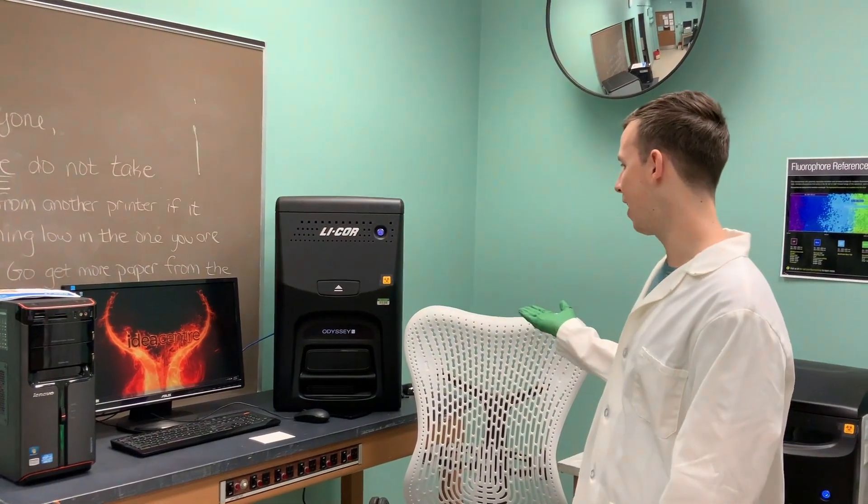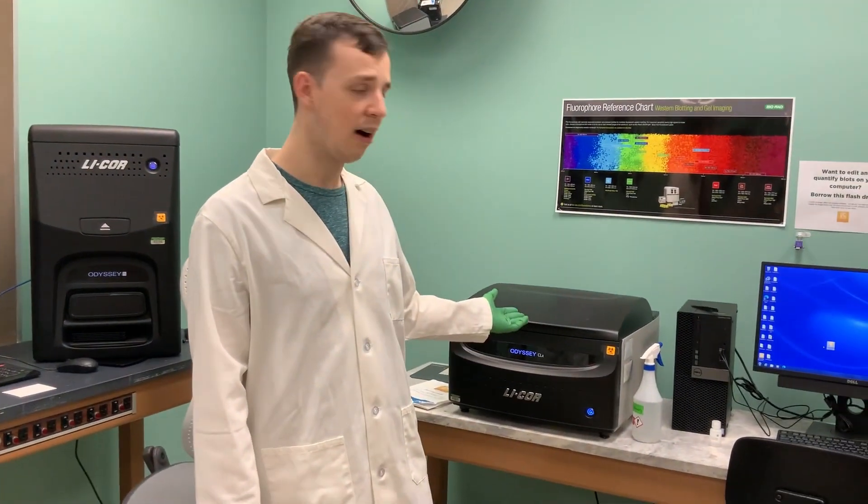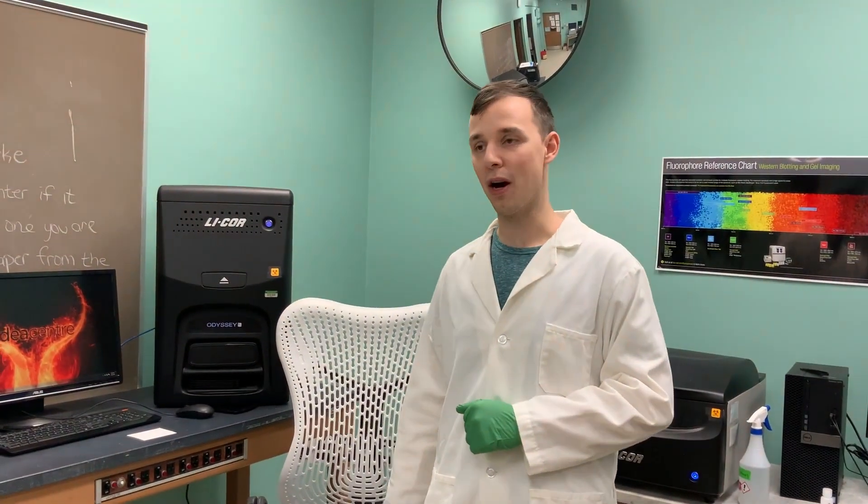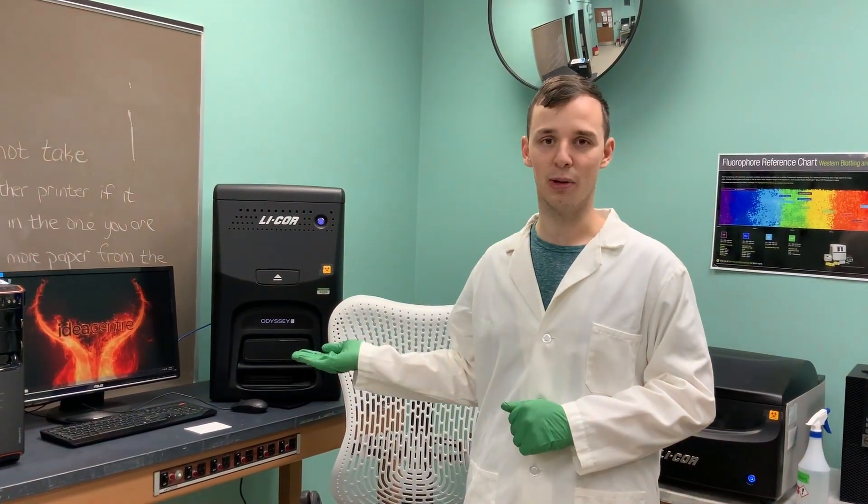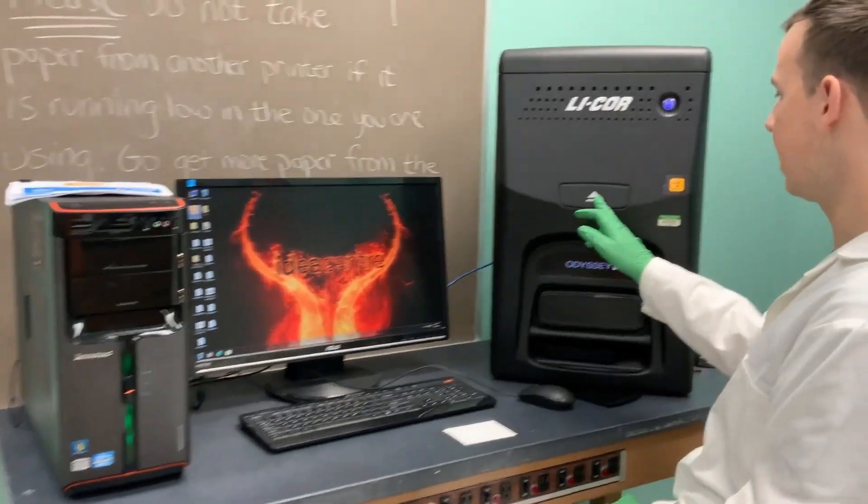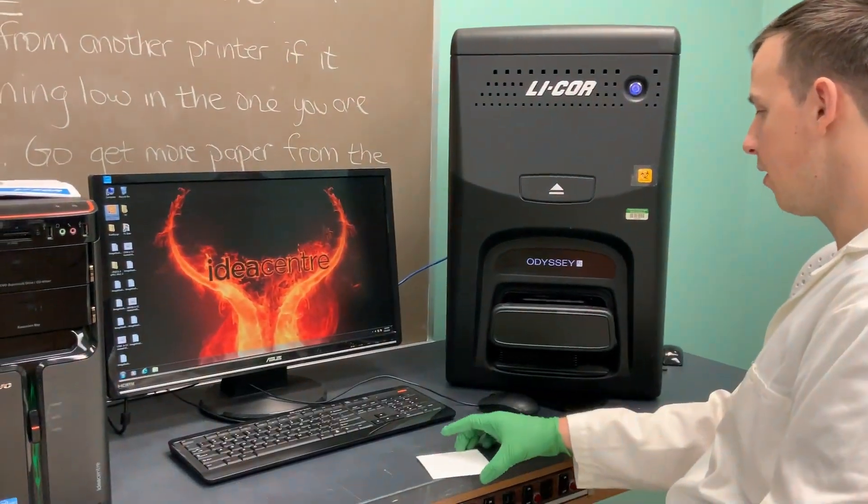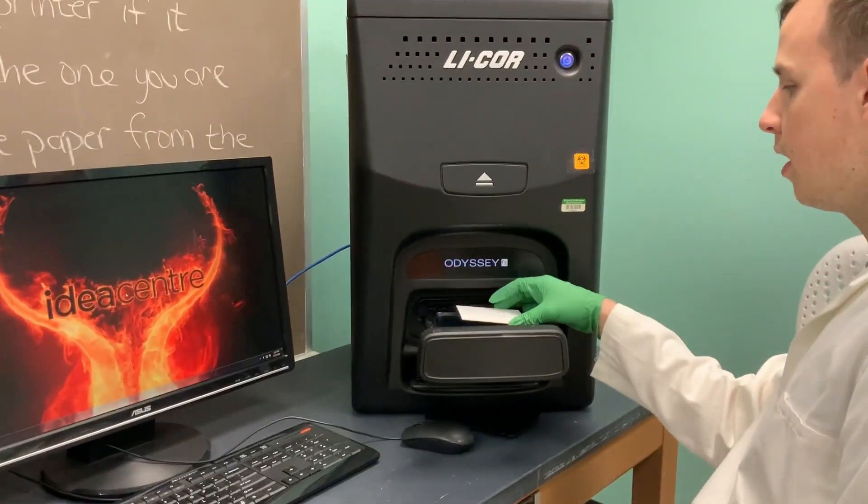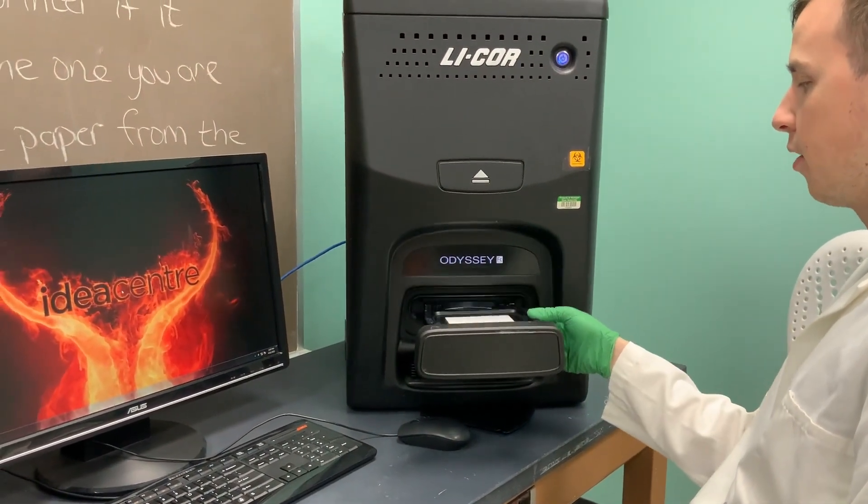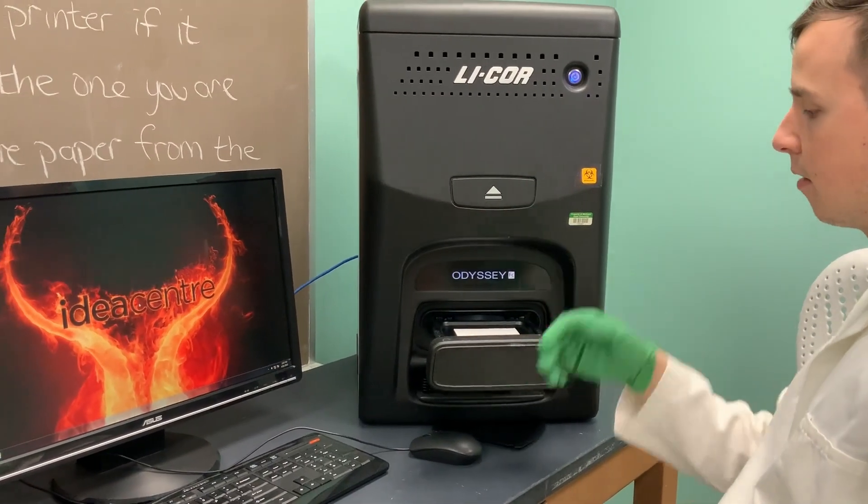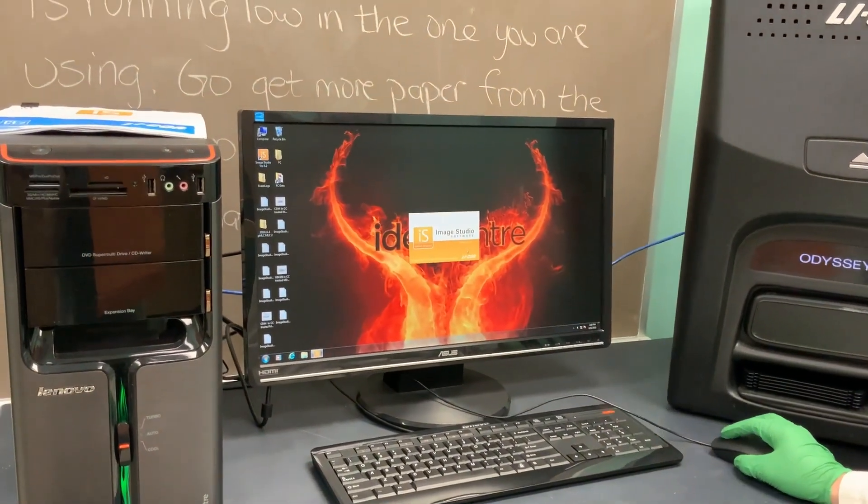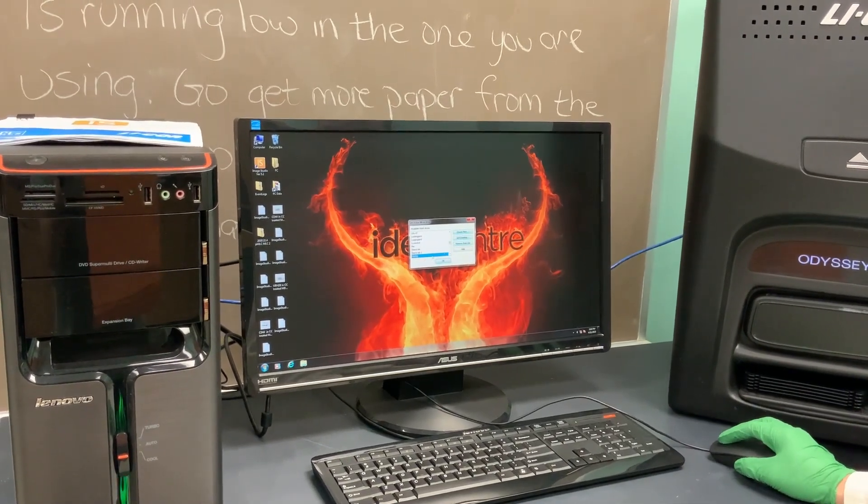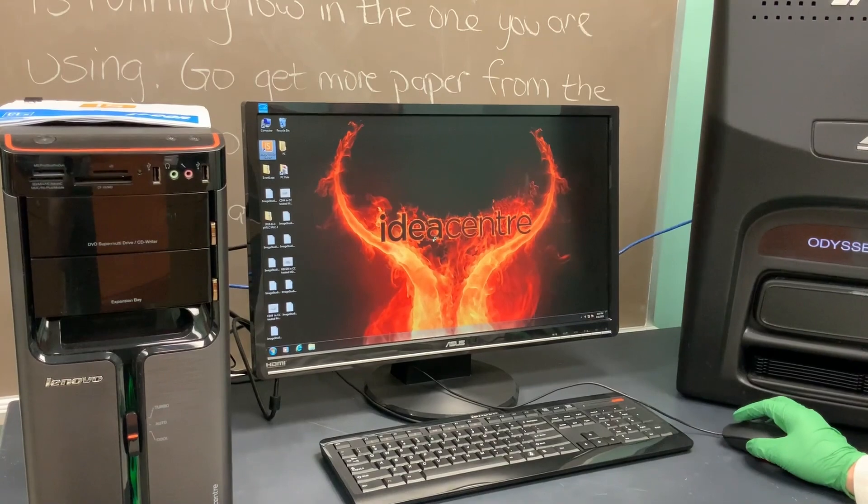We're going to talk briefly about how to use this LI-COR Odyssey FC system, very similar to the CLX. A lot of people in our department use this for blots that they have labeled with chemiluminescent. We can hit this eject button. Unlike the CLX, there's no selection region. You just use one of these trays, and there's usually already one in here. You just place your blot in the center. We can open the software and create a new workspace for you or open your or your lab's existing workspace.